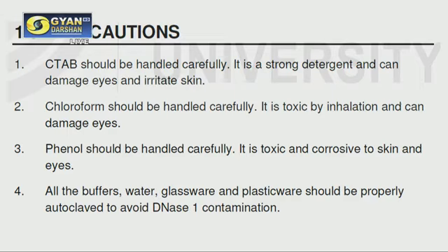All the buffers, water, glassware, and plasticware, as I have already mentioned, should be properly autoclaved. They should be sterile. Otherwise, if there is DNase contamination, your entire DNA will be fragmented and you will not get the intact band. So the autoclave part is very important, and you have to maintain sterile conditions for all the reagents, buffers, chemicals, glassware, and plasticware.